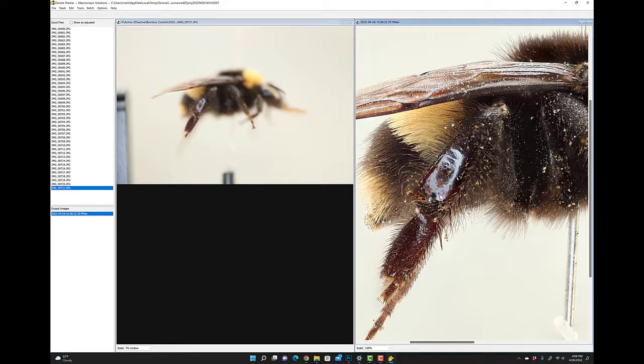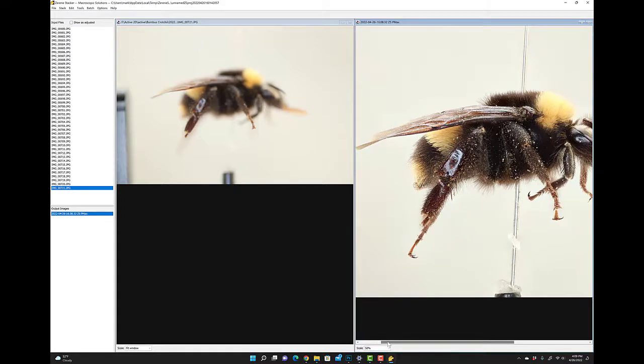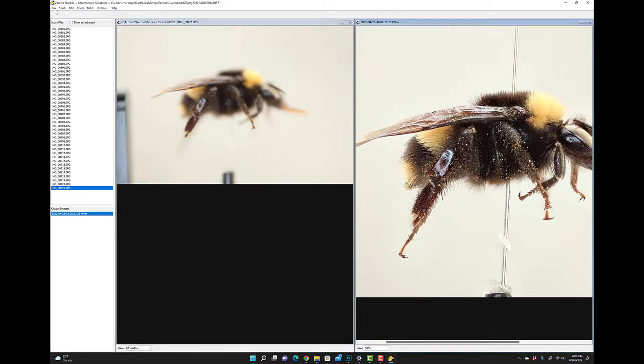But in this case, what it does do is show that this particular part of the specimen is reflective and also textured. So in some cases we are trying to reduce the amount of glare, yes, but I just want to emphasize why it's not necessarily such a bad thing. But at the very least, we are going to save this image and pull it into Photoshop and show you some techniques to get rid of that.